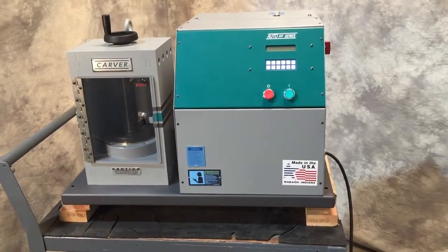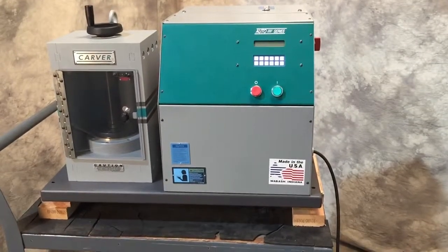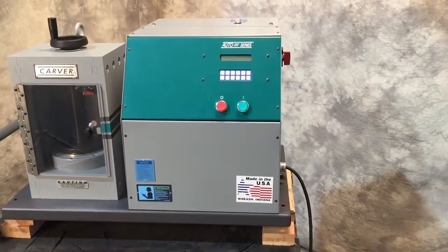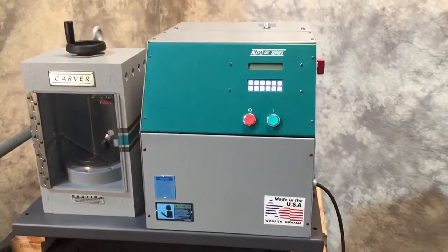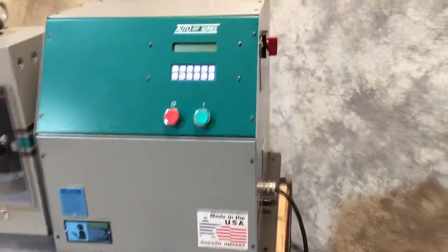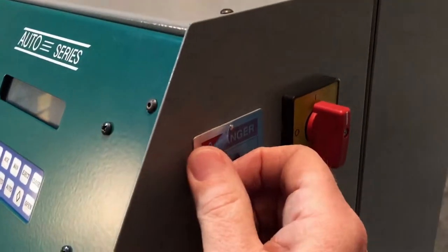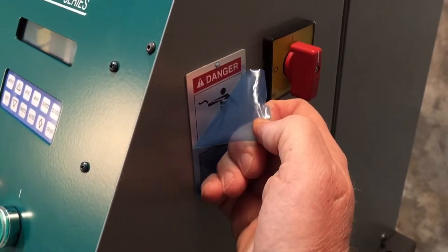Here we have a Carver Model 3887 laboratory auto pellet press in really good condition. It's had little if any use, and that is evidenced by the fact that it's even got the plastic on the safety plates.